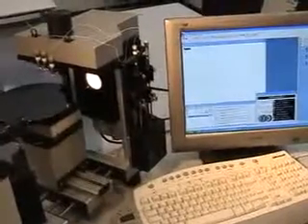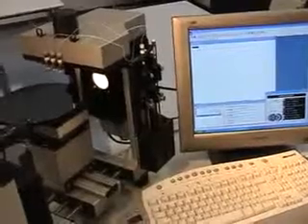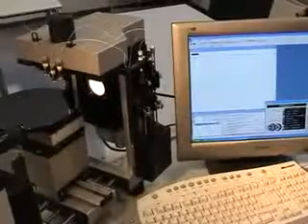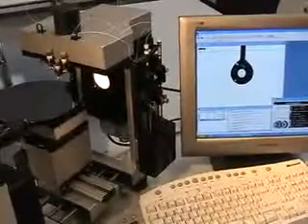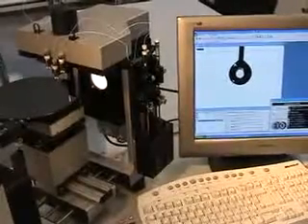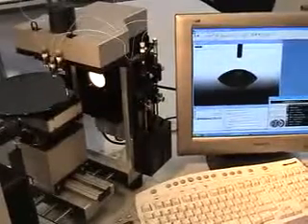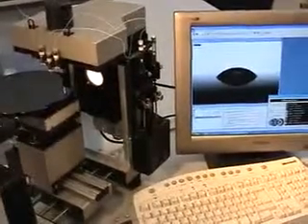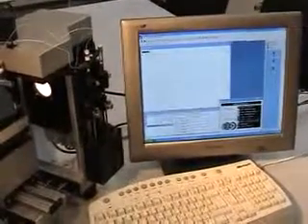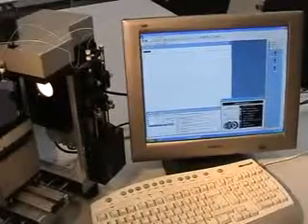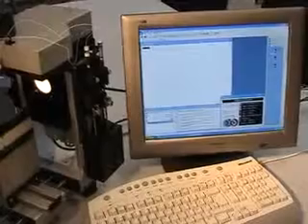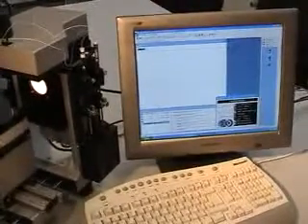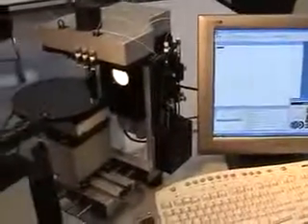Typically a measurement will take between 5 and 10 seconds, depending of course also on the dosing volume, the dosing rate, the distance between the two points. And we can also set some waiting time between the dosing and the performance of the measurement. So depending on our definition, it can be that within a few minutes we have already mapped the complete wafer.